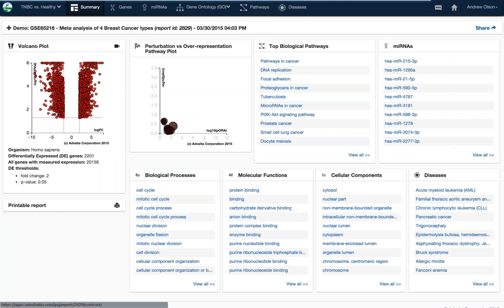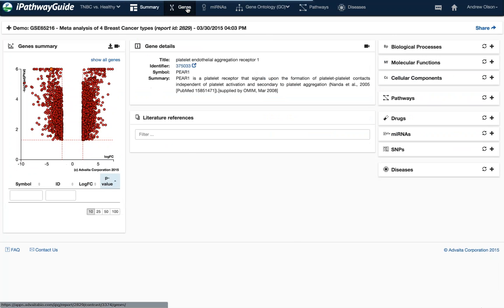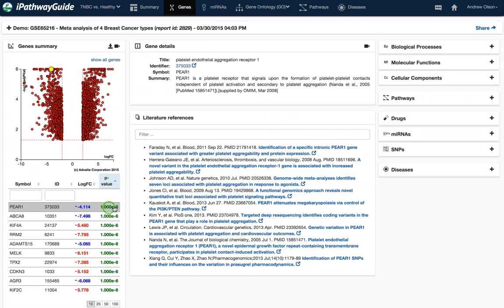So the p-value, it's a range from 0 to 1, obviously. In the actual analysis, in this genes table, the green is highlighted because it is significant. It's in bold. And then we have the fold change that's also significant.